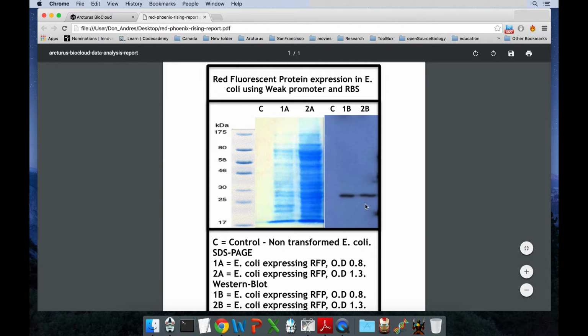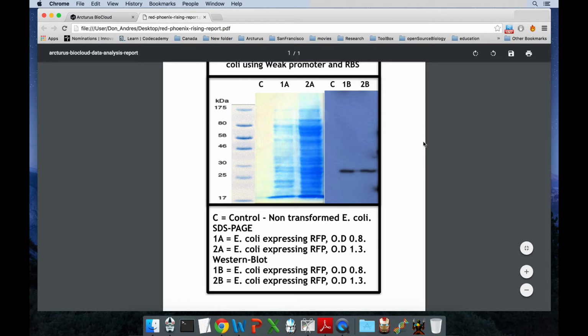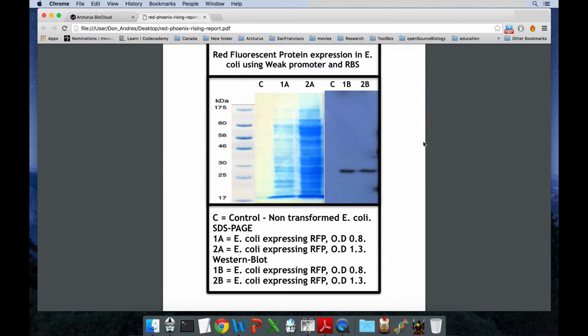This screencast is just telling you the basic experiment you can develop in our platform. So you express a protein. This will be the equivalent to developing a hello world when you are developing software, but this is with biology, to express your first protein. Now you are ready for going there and trying any protein that you are interested in and sending it to our platform so we can prototype your product.